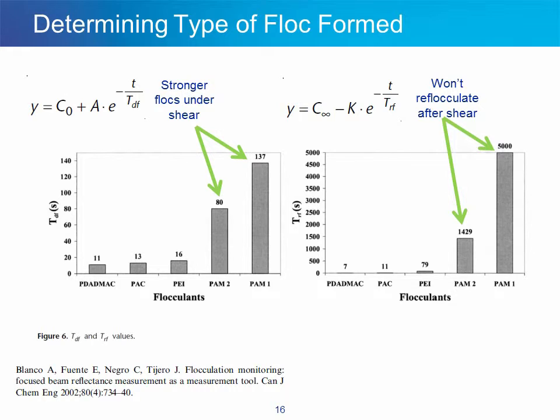So you could go through all this work where you actually flocculate your cell debris, for example, only to have it deflocculate under varying shear conditions before it gets to the centrifuge itself, and that would defeat the whole purpose. So this is a very nice experiment to understand the stability and the strength of the flocs that you're making using different flocculating agents.